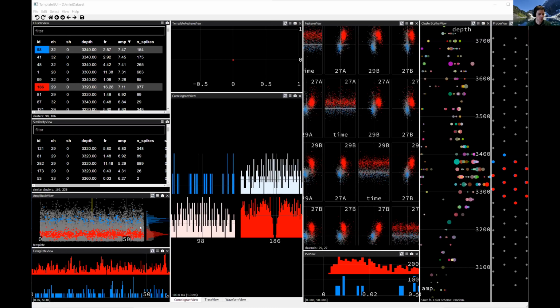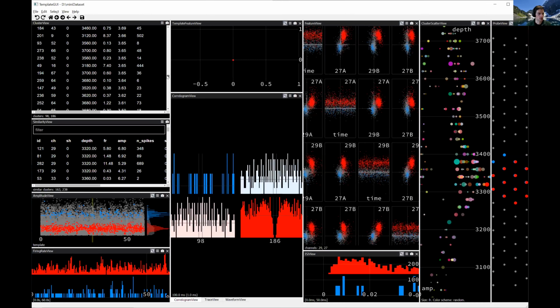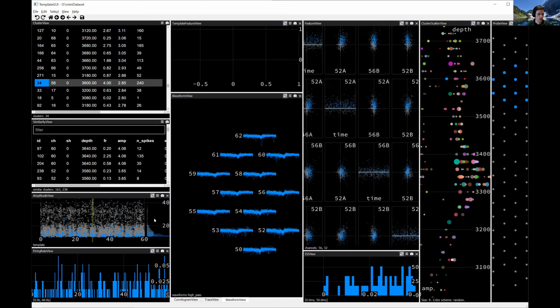Okay, amplitude view. The thing that we're looking for here is whether these amplitudes indicate that the neuron has run into the noise floor. And you can see that these gray spikes, which are just from other neurons that are around, have this hard cutoff on the bottom, but they don't have a hard cutoff on the top. That's because you expect any biological variable you measure, like the spike amplitude, to be normally distributed, Gaussian distributed, like these blue and red curves. But if they're not normally distributed, then that can indicate that you're missing spikes to the noise floor. So this looks like half of a Gaussian distribution. So this neuron, which has a low amplitude, is probably missing a bunch of its spikes to the noise floor. So that's a particular kind of error that this neuron will have, that it's probably missing some spikes.